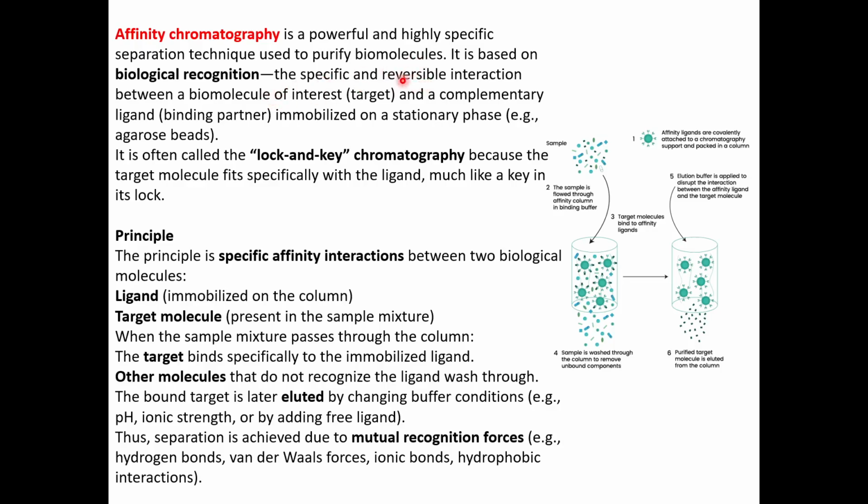So it is very important that the interaction between the target and the ligand should be reversible, because whatever sample you have, whatever protein or any biomolecule that you want to purify, it has to bind to the binding partner, but also at certain condition it has to be unbound from it so that you can purify it.